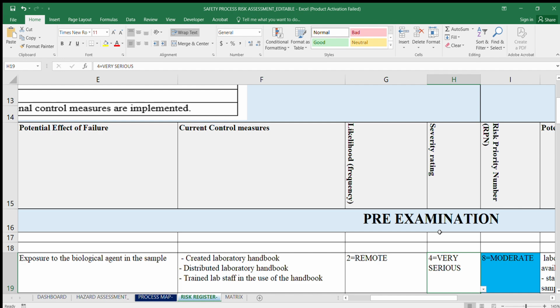But mostly our health is never constant. Sometimes you may be sick, sometimes you may not be. So it's never really constant. The only way you can reduce at that particular point is after you determine the host status, and that becomes a bit complicated. So at that particular point, the severity will constantly remain the same as in the hazard assessment.